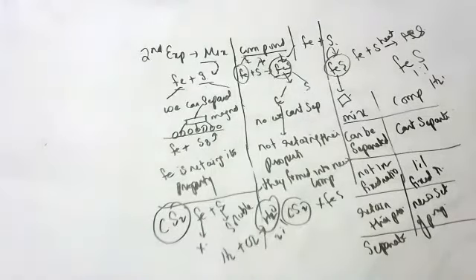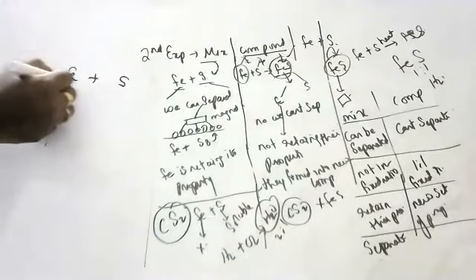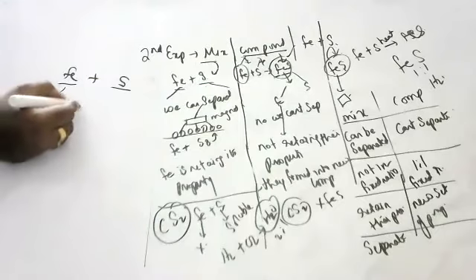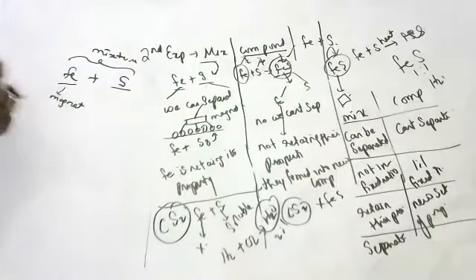Children, those who did not understand the activity, slowly I will say again. My intention was to explain about iron and sulfur. Iron is there, sulfur is there. In mixture form, you can separate iron individually. How? By using a magnet.